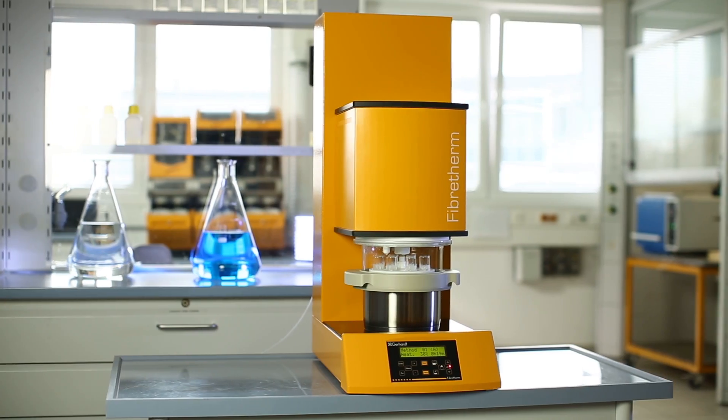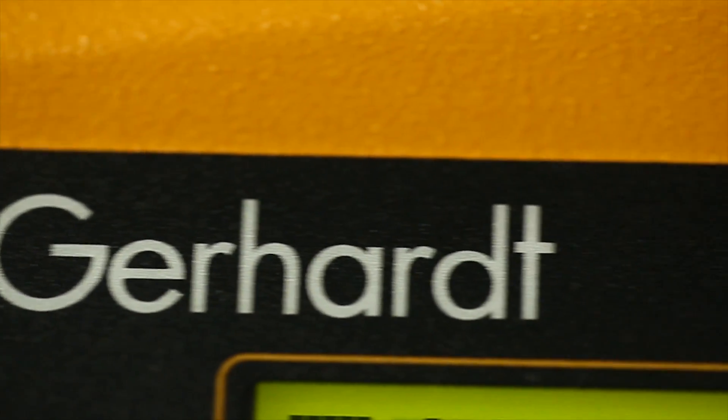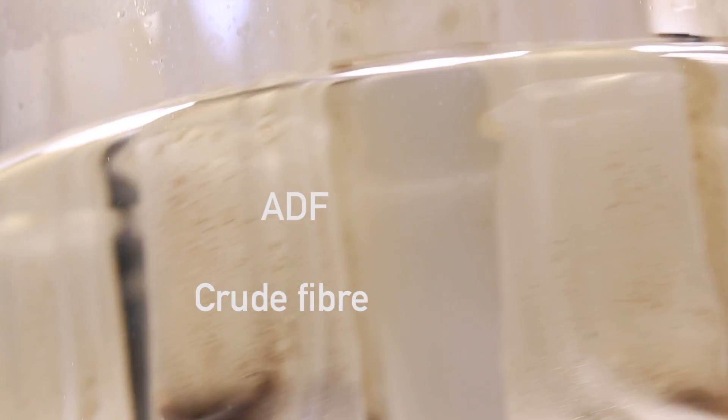Fiber-therm handles all digestion and filtration processes for the determination of crude fiber, ADF and NDF fully automatically.